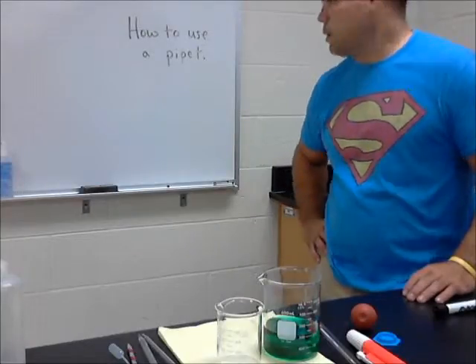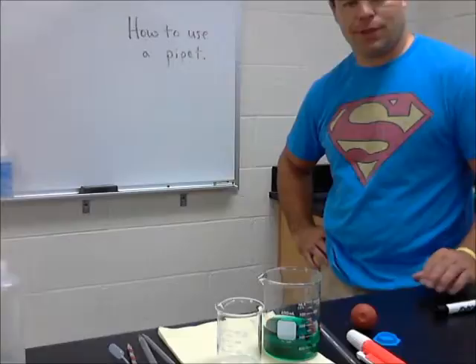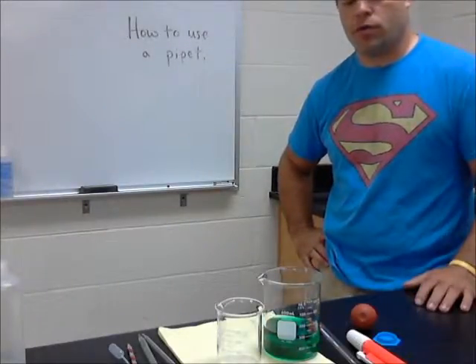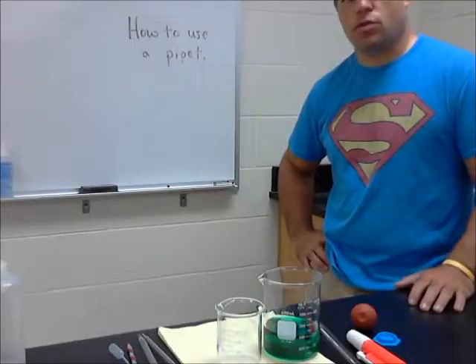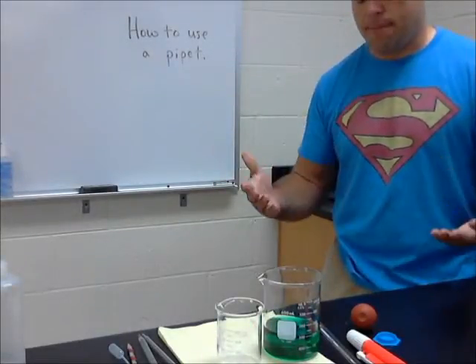Mr. Schweitzer, and I'm here to show a little video on how to use a pipette. More than likely you're going to be doing a lab coming up soon that's requiring you to use a pipette, and this video is going to show you how to use it, and I'm kind of expecting you to be able to use them when you come to lab.